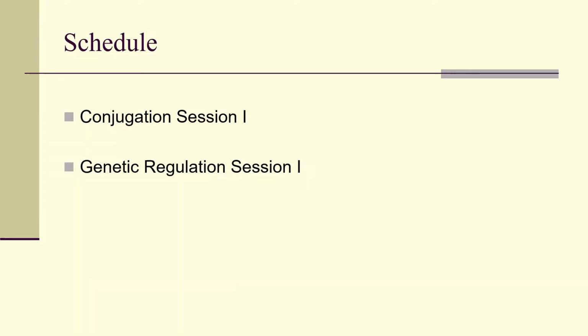In this lab, we will perform the first session of conjugation. Conjugation is a part of the transformation conjugation experiment. And we'll also start a new experiment, genetic regulation, and today we will perform the first session of genetic regulation.